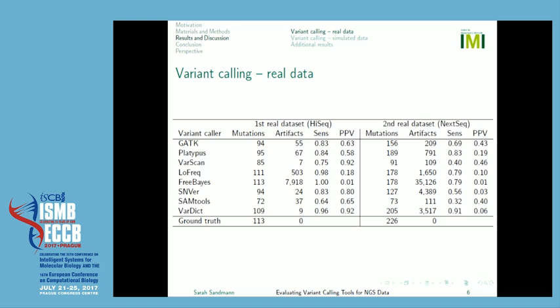However, when you go for the artifacts then, you will quickly see that Freebayes, our good sensitivity tool, was so bad at PPV. So it would, for a clinical use case, mean you have roughly 8,000 variants, and you have to identify roughly 102 calls in it, and this is just a no-way scenario. So when you combine both parameters, you will quickly see that VarDict is actually best with respect to sensitivity and PPV. However, then we analyzed our next data set, and things looked a bit different there.